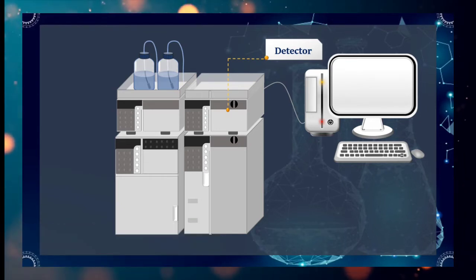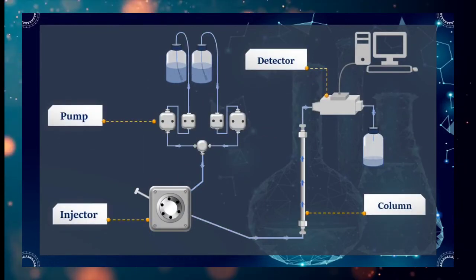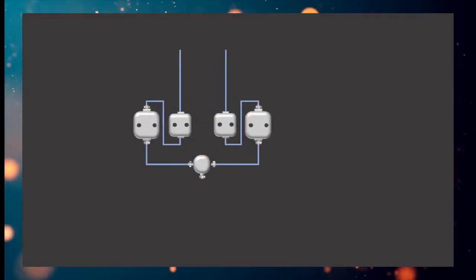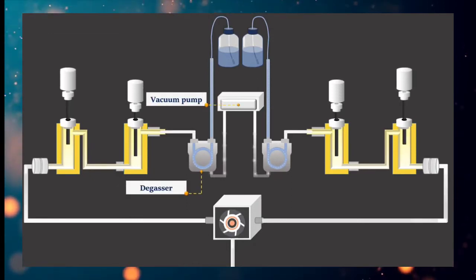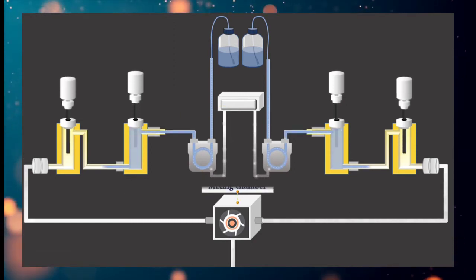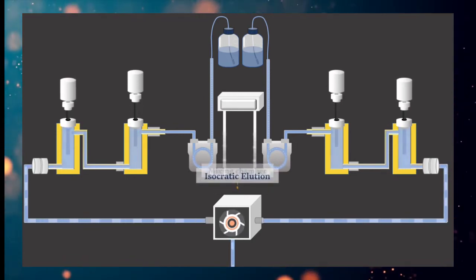The presence of the mobile phase and stationary phase leads to a perfect separation of important components in the food product. After the separation, the sample is sent into the detector section to identify the composition of each compound in the food sample. For our discussion, which is the application in the food industry, we can trace the level of pesticide and toxins in the food product.